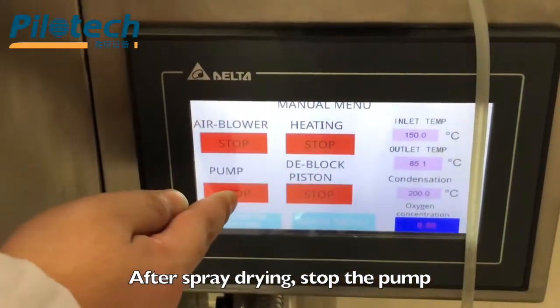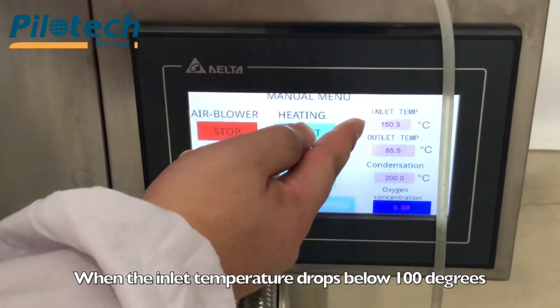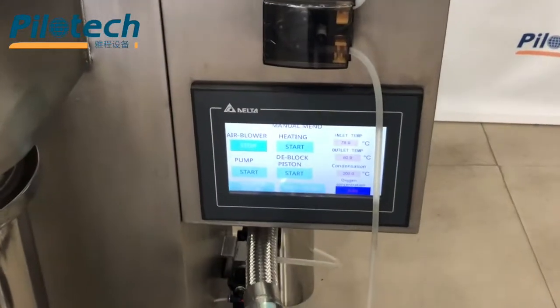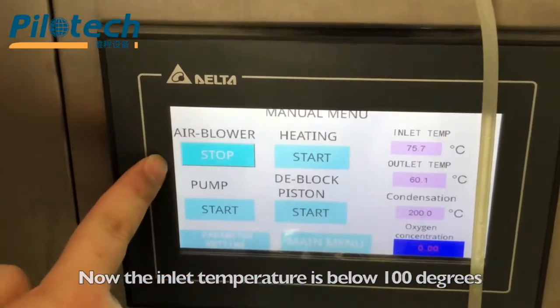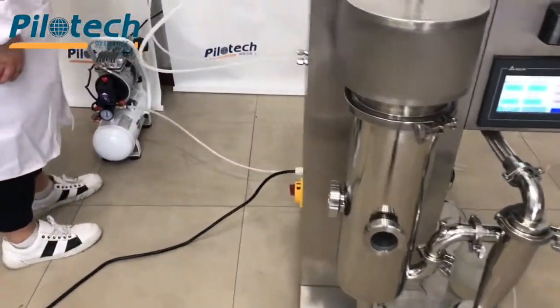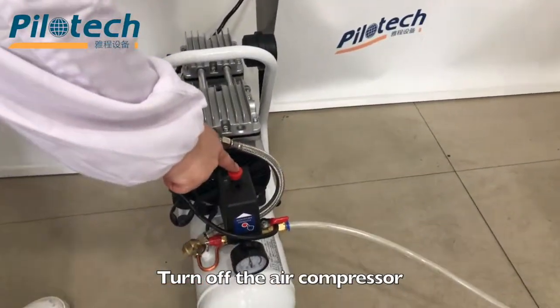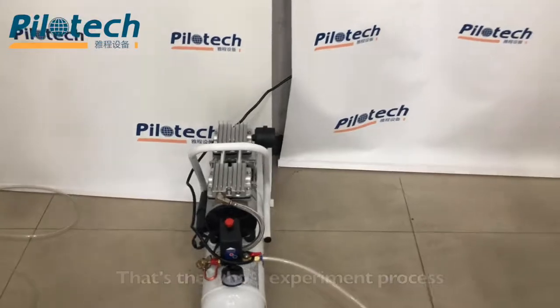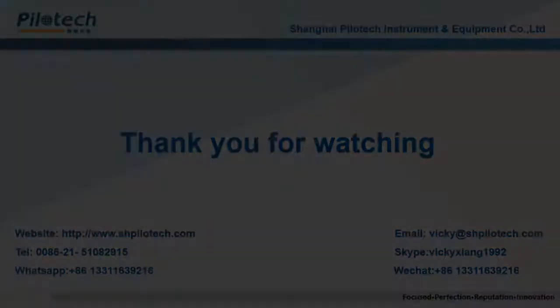After spray drying, stop the pump and stop the deblock piston. Stop heating. When the inlet temperature drops below 100 degrees, stop the air blower. Now the inlet temperature is below 100 degrees — stop air blower. Turn off the main power switch. Turn off the air compressor. That's the whole experiment process. Turn off the air roller. Thank you.